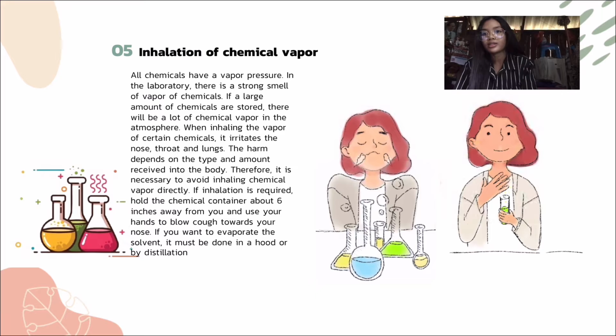Therefore, it is necessary to avoid inhaling chemical vapor directly. If inhalation is required, hold the chemical container about 6 inches away from you and use your hand to waft the vapor toward your nose. If you want to evaporate the solvent, it must be done in a hood or by distillation.